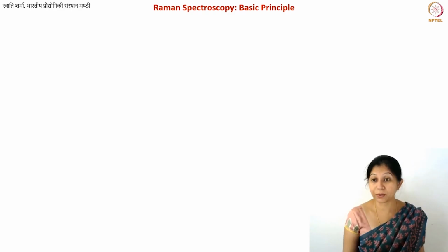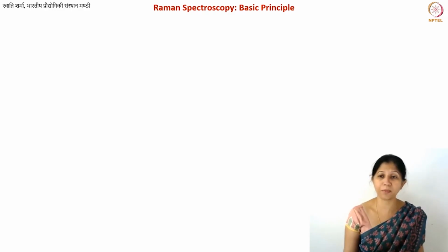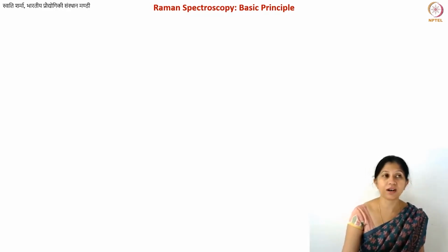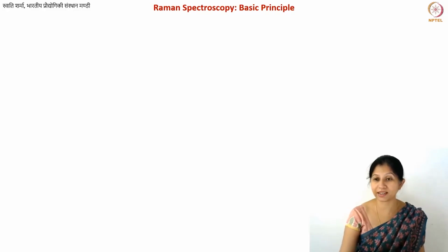In this lecture, we are going to discuss Raman spectroscopy, which is yet another very important tool for understanding carbon materials. Raman spectroscopy is often used as a supplementary or support technique with X-ray diffraction when it comes to large-scale carbon materials. For example, when we want to understand how a carbon material is converting from disordered carbon to gaining more order or graphitic content. But in the case of nanoscale carbon materials, it is sometimes even used as the only characterization technique.